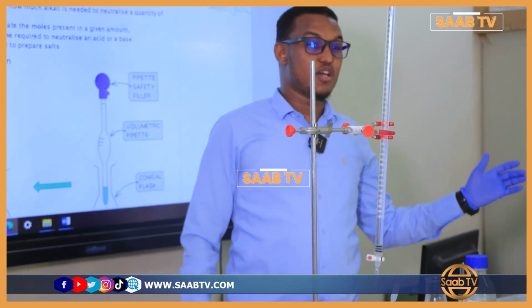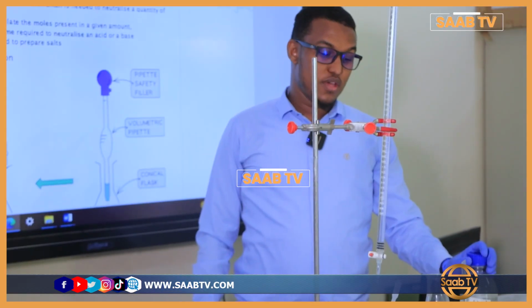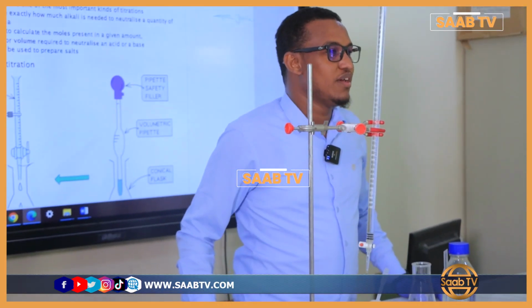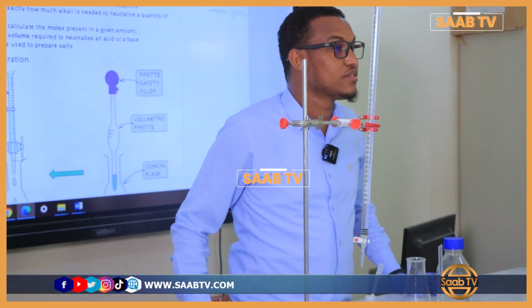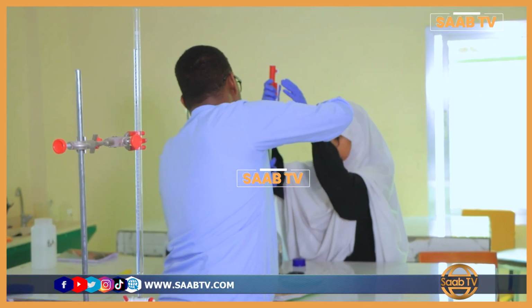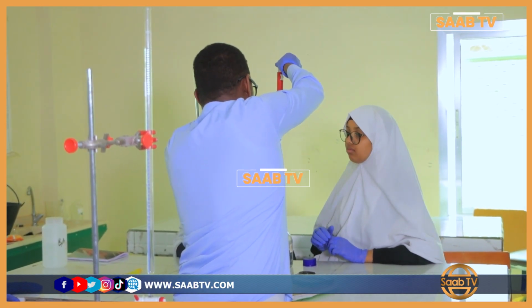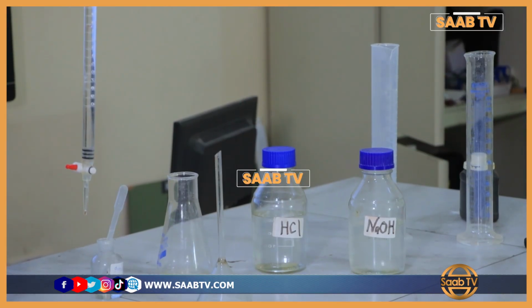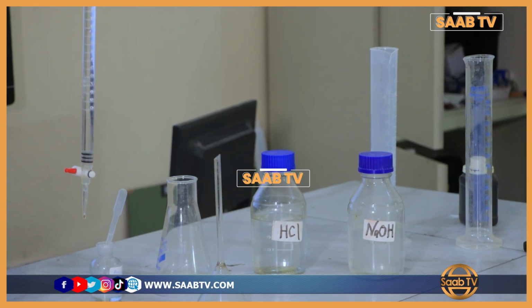Bismillahirrahmanirrahim. Today we are going to look at the practical procedure which is called a titration. So can any student explain the aim of titration, why we do the titration? The aim of titration is to find out the amount of acid needed to neutralize an alkali. Yeah, titration helps us to find the exact amount of acid that can neutralize a specific amount of alkali, or vice versa.